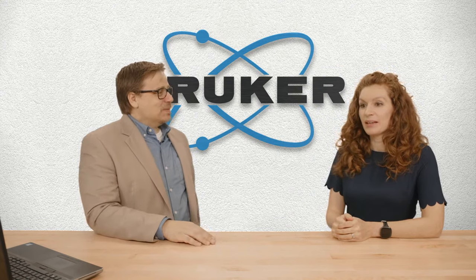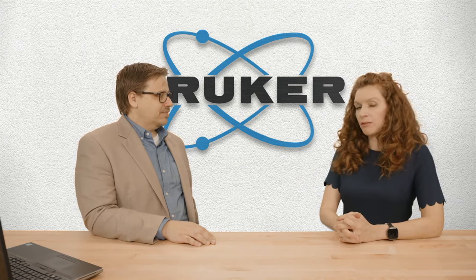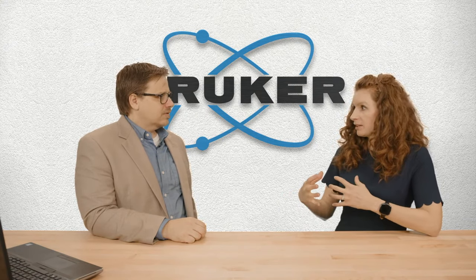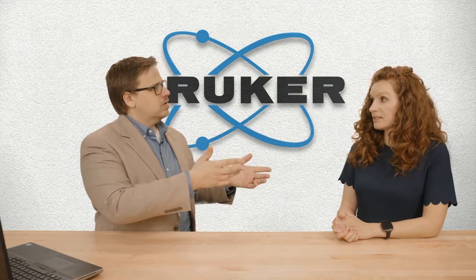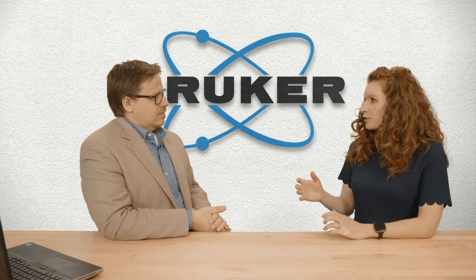No, that's true. The ED systems are usually smaller, the ones that we have. If you have a floor standing 4 kilowatt system, you also need to think about having a chiller, because that is a lot of power that needs to dissipate somewhere. What was the rest of the question? So it sounds like EDXRFs typically are a little bit smaller. They're either benchtops, and I know handhelds also use that EDXRF. Yes. But then WDs start at benchtop, something like the Jaguar, S6 Jaguar. Yes. Then we go up to the S8 Tiger. That's a freestanding 4 kilowatt. Correct. Full power machine. Also, the benchtops you can plug into a normal wall outlet, whereas for the large systems, you need to have a specific setup.